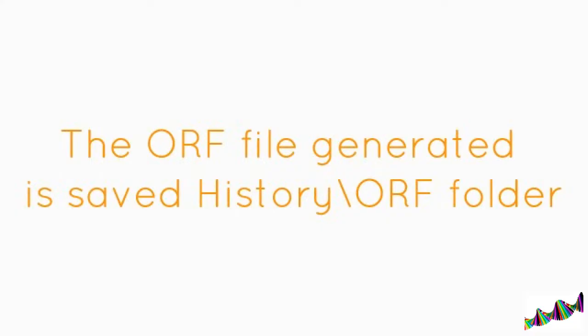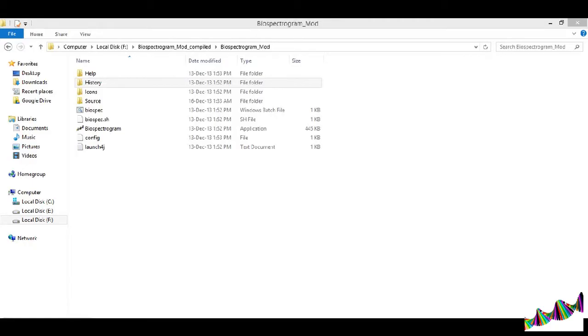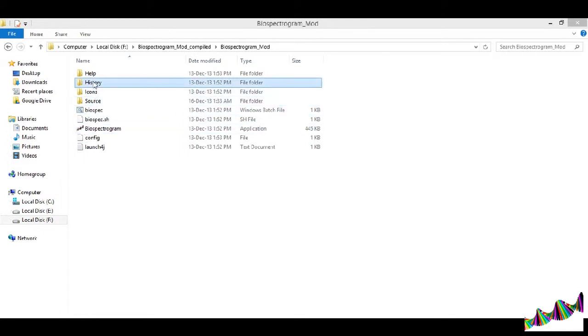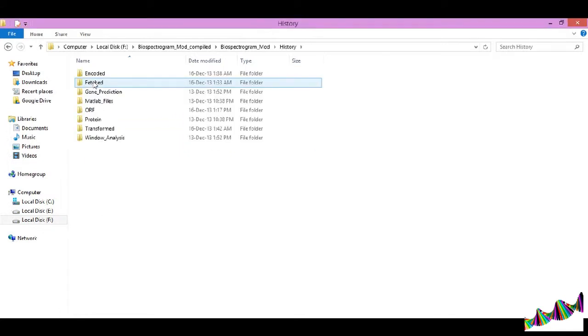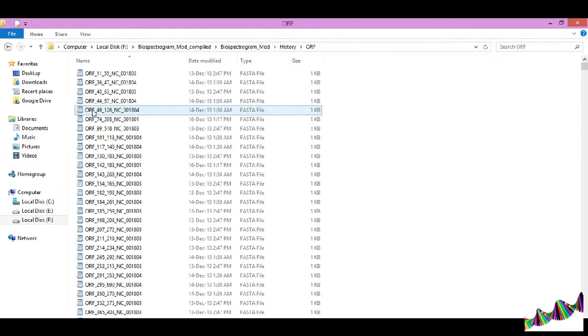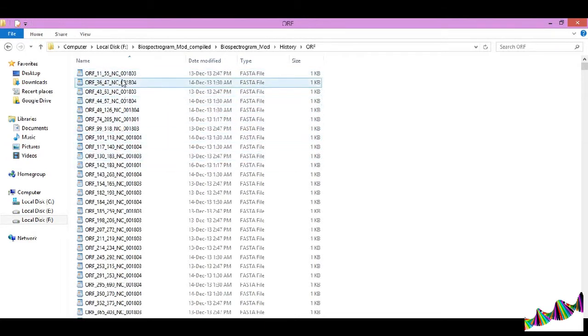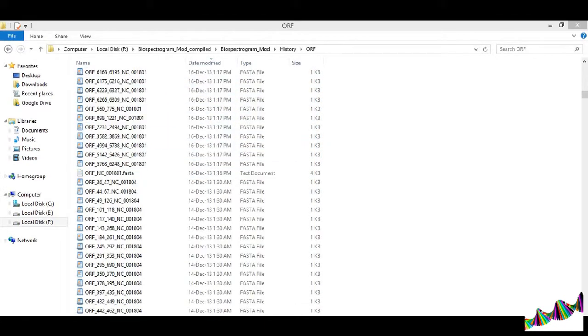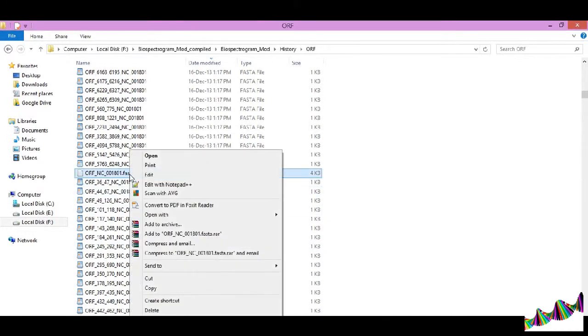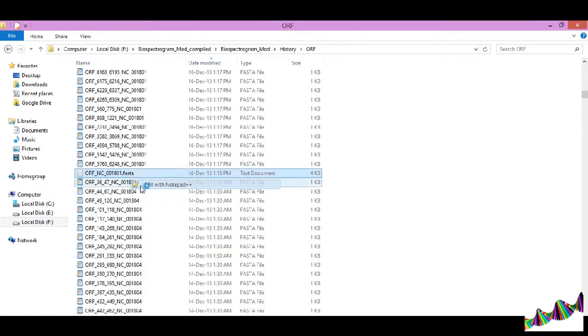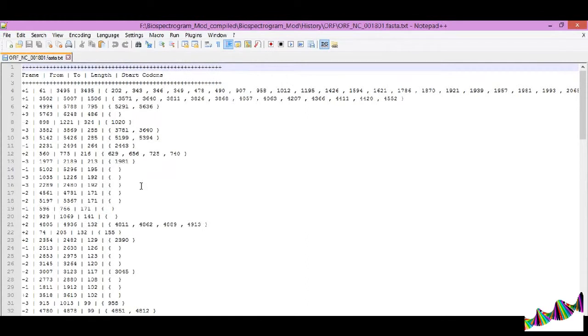You can now view the file generated under the history folder, ORF subfolder. Select the text file to get a complete list of the ORFs. You can open the text file with any editor.